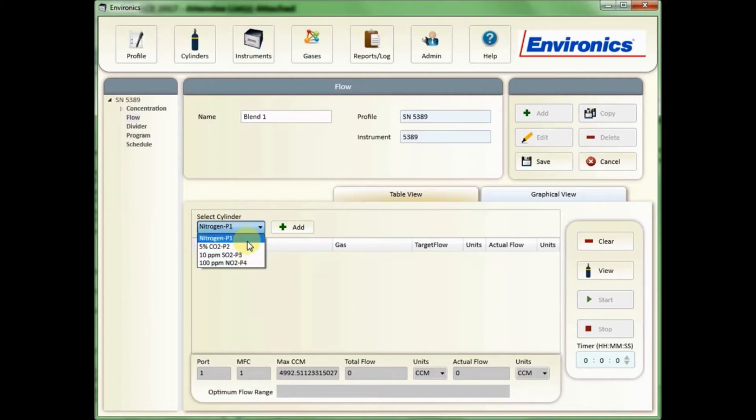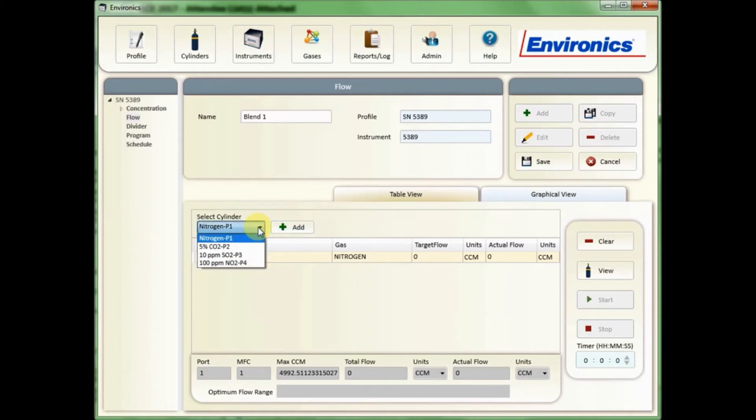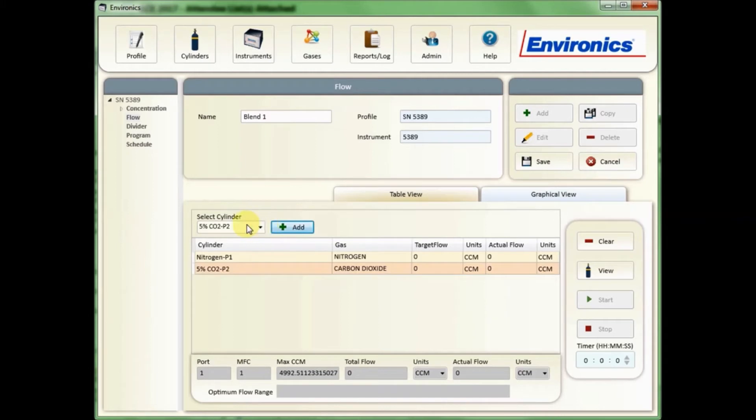So you could have a flow mode that was just nitrogen like this, or you could add additional. So for the first one let's go ahead and add three. We'll add our CO2, our nitrogen, and our SO2.